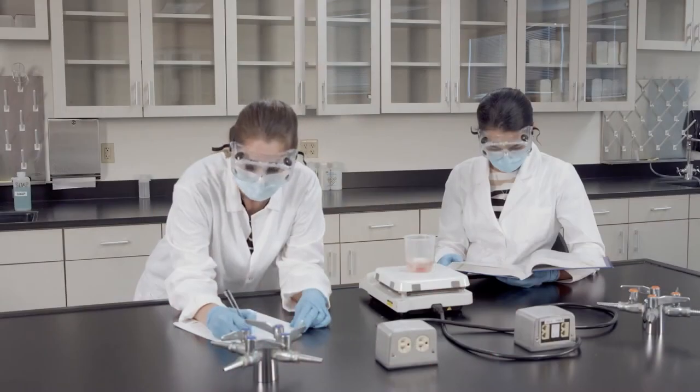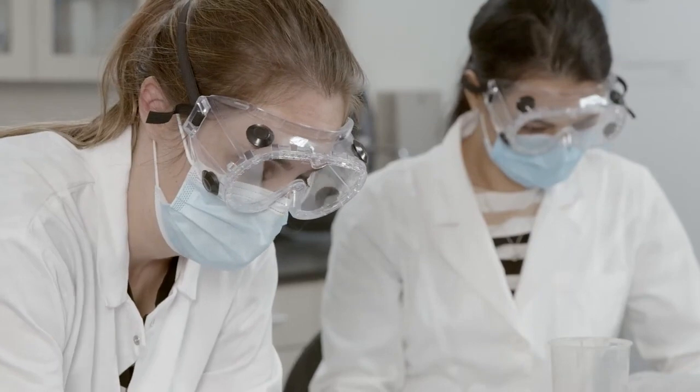It is possible that you will spill a chemical or hazardous material on your skin in the lab, especially if you're not wearing protective sleeves or a lab coat. Depending on your campus or your course, lab coats may or may not be required.